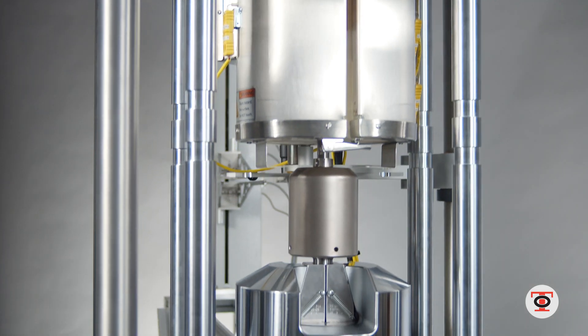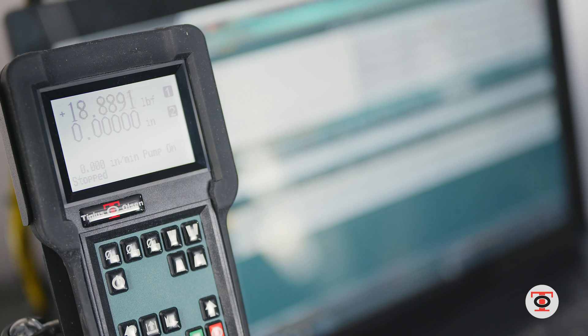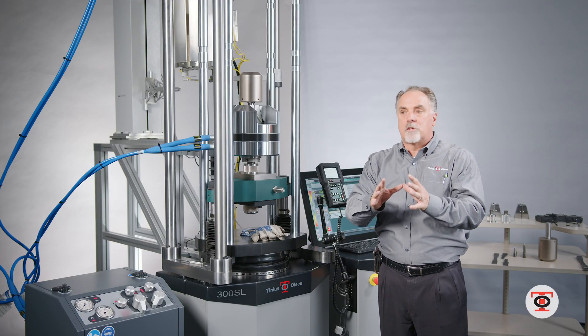The software is integrated into the machine. It runs multiple machines — I can have a plastics lab with impact, a melt indexer, and a tensile machine all configured into one software.